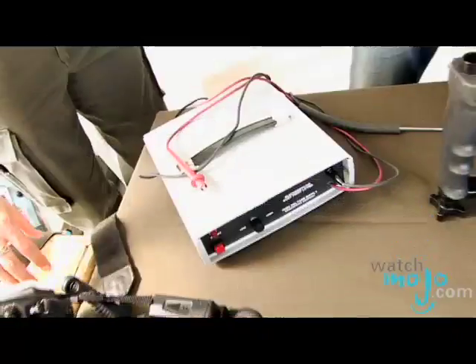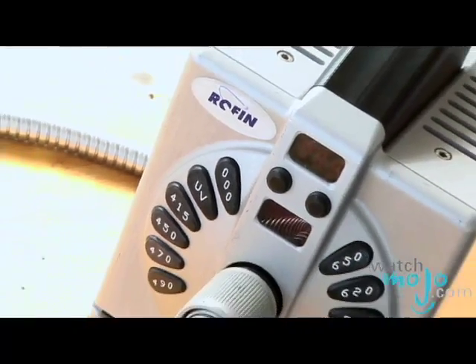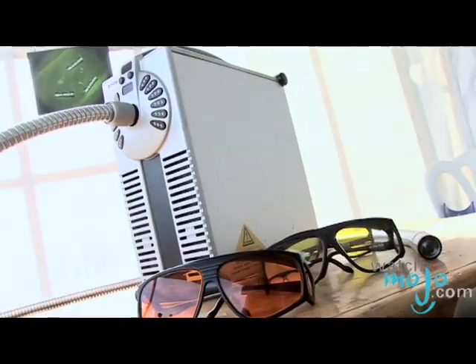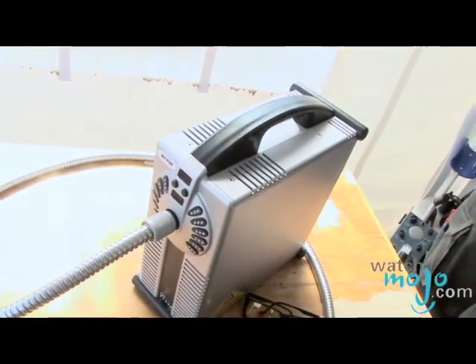We're here looking at the crime scene investigation tools used to find out who did it. So we're going to look over here to our right, and we're going to see something called a polylight. You'll notice that on the TV programs that you probably like, they have a special light that they shine onto the ground or onto the bed of the crime scene to see things like sperm, vaginal fluids, and other awful things. This way they can see these things under a microscope if you can look at these pictures here. And each one is identifiable, so they can find out who is there and how long ago they were there.